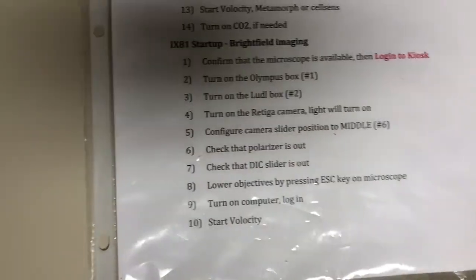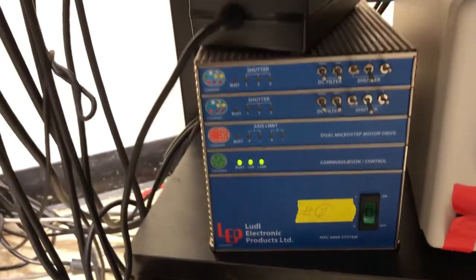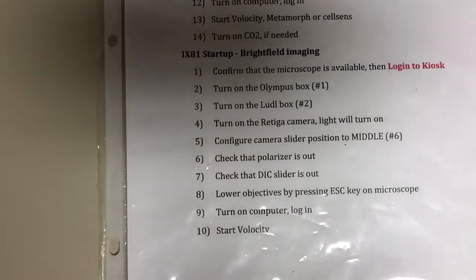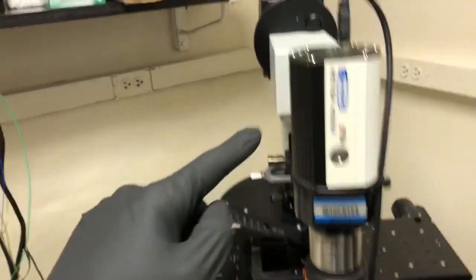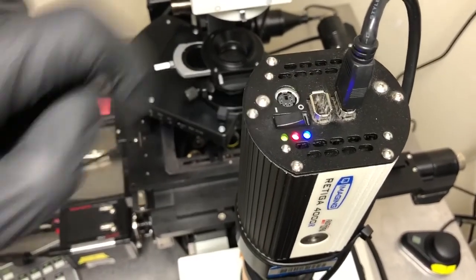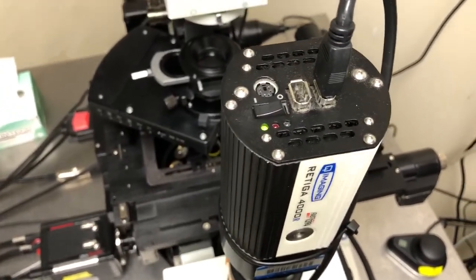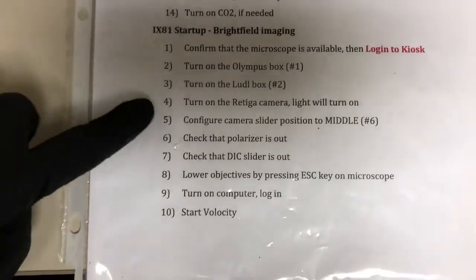The next step is to turn on the little box, which is item number two — that's underneath the air table right here. The next step is to turn on the Ritiga camera. This will be used for bright field imaging. There's an on/off button at the top; when you turn it on, you will see the lights come on.